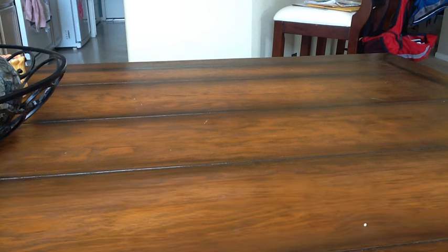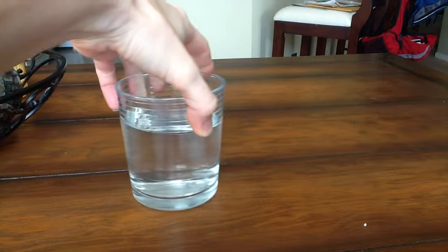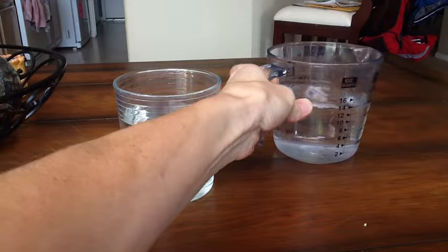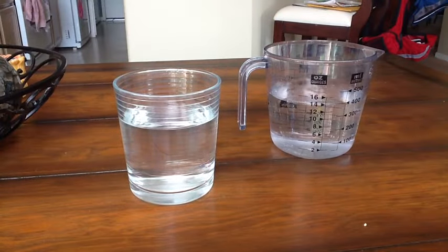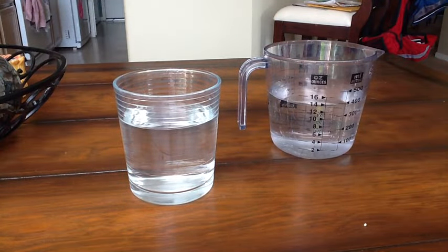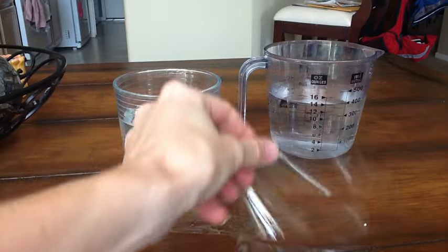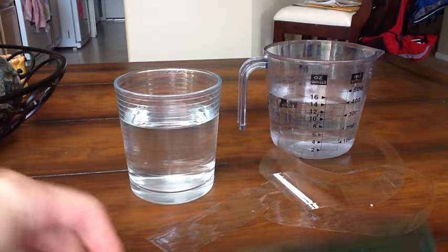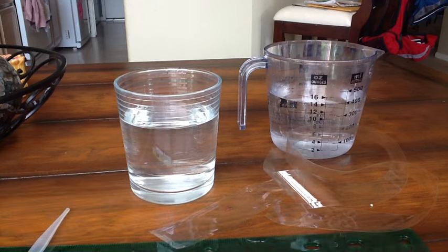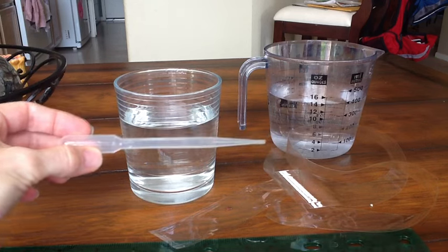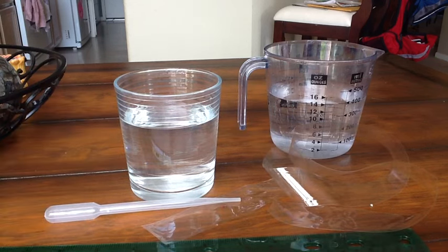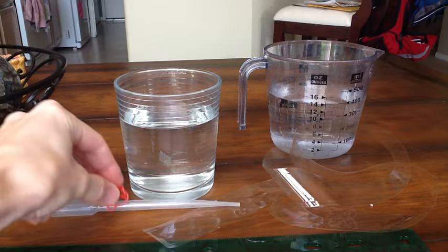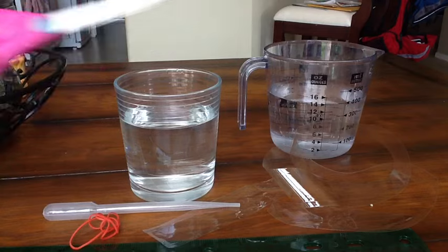First let me run through some of the materials. You're going to need preferably a beaker filled with water. I have a cup here. And then you're going to have your solution that you're going to be filling up the dialysis tubing with. You're going to need dialysis tubing, a ruler, a medium-sized pipette, some really thin rubber bands, and then a pair of scissors.